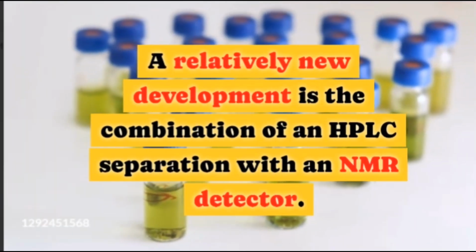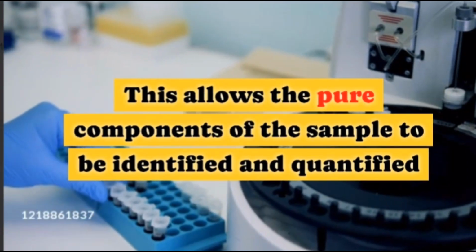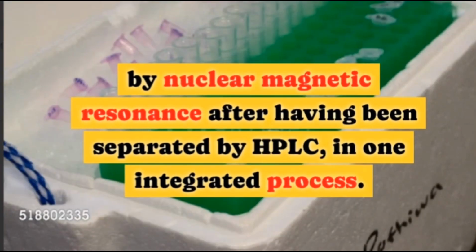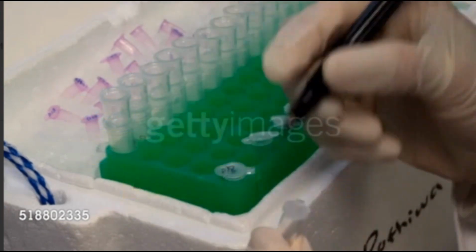A relatively new development is the combination of an HPLC separation with an NMR detector. This allows the pure components of the sample to be identified and quantified by nuclear magnetic resonance after having been separated by HPLC, in one integrated process.